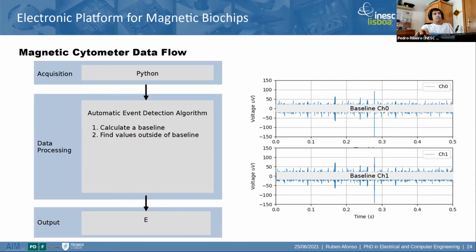No, if we measure every time, yes. Okay, so what do you mean exactly if you measure every time? In reality, we don't need to make the baseline. We can just integrate a small part of the signal at the beginning of each experiment, and it must be noise. And we can use that value as the baseline.